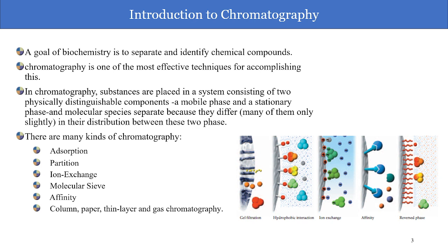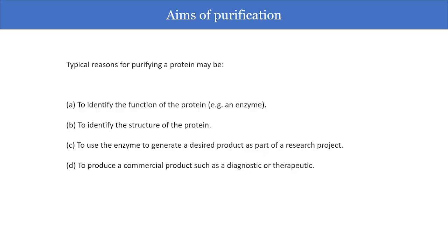These are the many types of chromatographic techniques that are basically used to separate and identify your desired proteins from a mixture or a crude extract. So you can separate them, identify them, purify them. That is what we want to get, the pure protein or pure compound that will help us in carrying out the experiments in a much better manner.